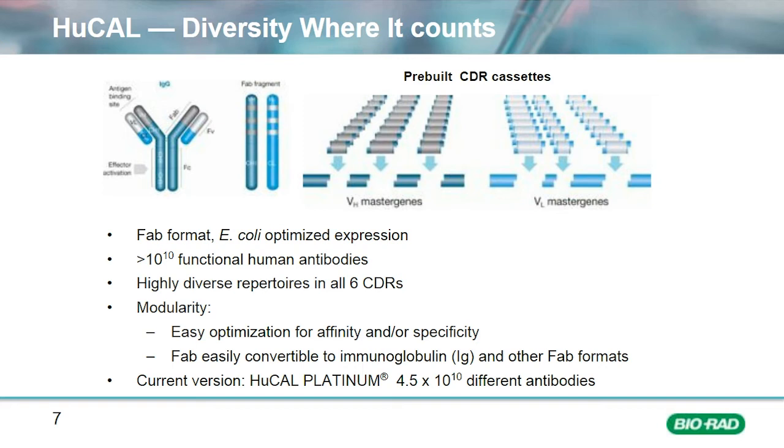So it's a fully synthetic library, and there's no particular immunological bias. The library has undergone no process of tolerization, and the library is not in any way similar to an amplified immune repertoire. So the nature of the library is such that it's just a really very diverse library.